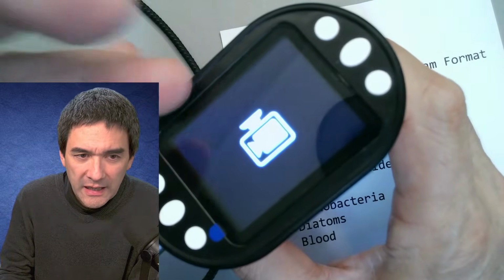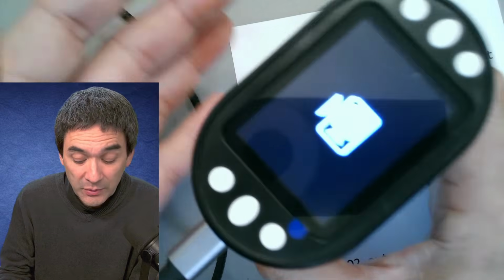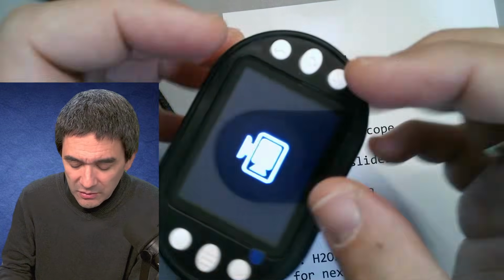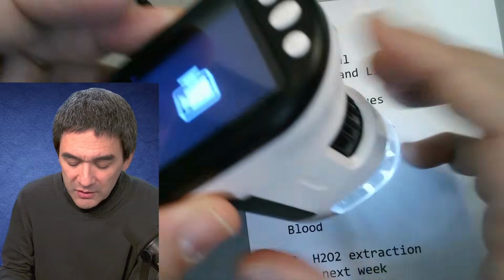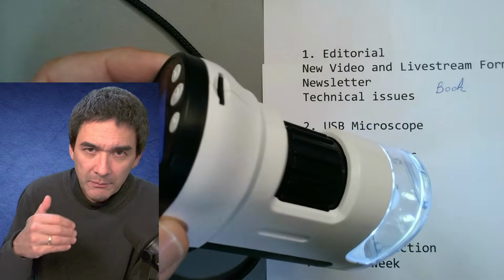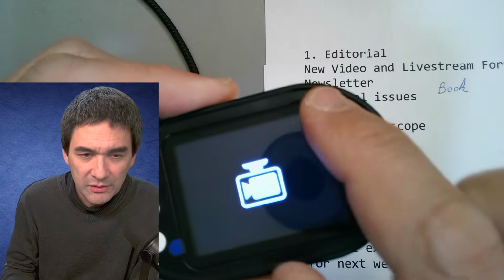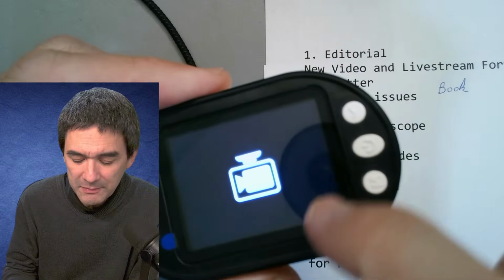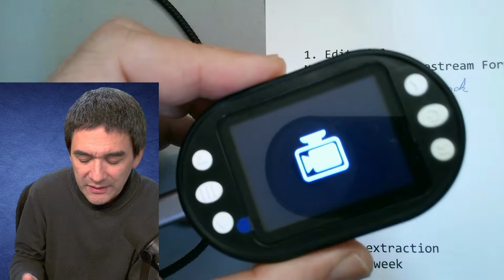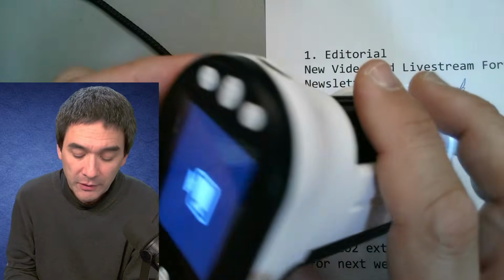You see, if you already have a screen and need to observe the specimens, then I think it should at least reflect what it's recording, and not distort it. So in other words, if you record it on the SD card, everything's going to be fine, right? And also if I feed it into the computer, it's also going to be fine. But just over here, this one is not in the proper aspect ratio, right? The picture that's wider is actually squeezed together, and this is a little bit unfortunate.